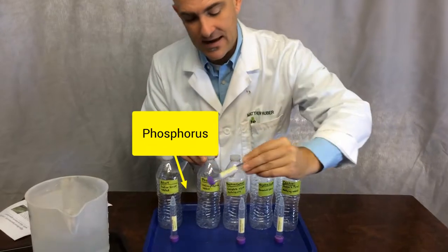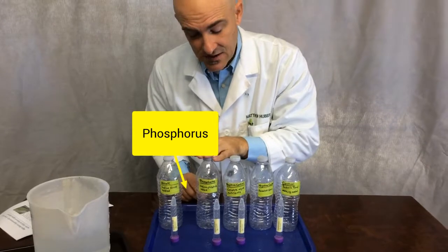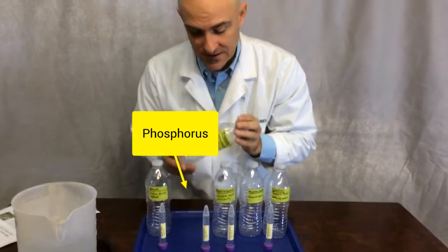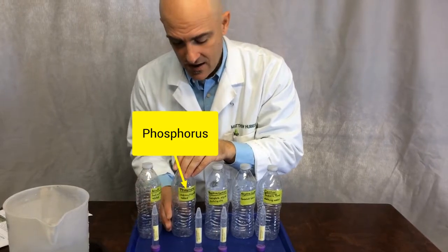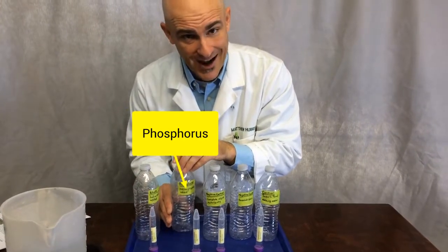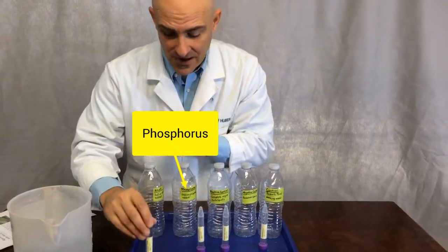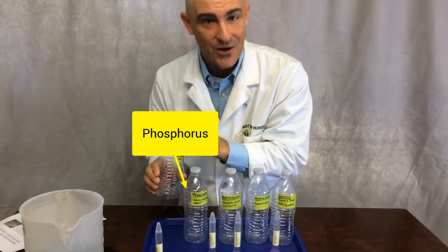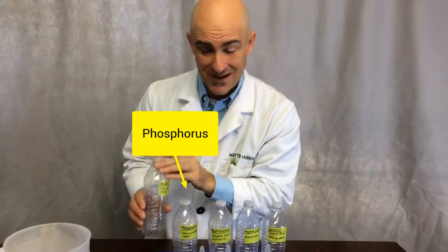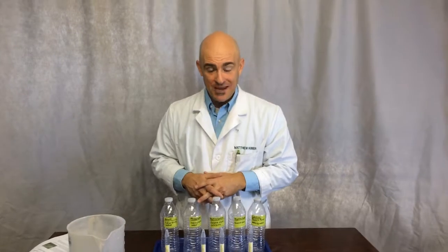Next, you're going to be adding in a phosphate control, or a phosphate test. This is going to be adding phosphorus to your system. And if there's an algae bloom that occurs here, then that means that your algae was phosphorus limited. And finally, sodium nitrate, where if you add this and the bloom occurs in this bottle, that means that there was nitrogen limiting. Okay, this is the Algae Research Supply Algae Bloom Kit.